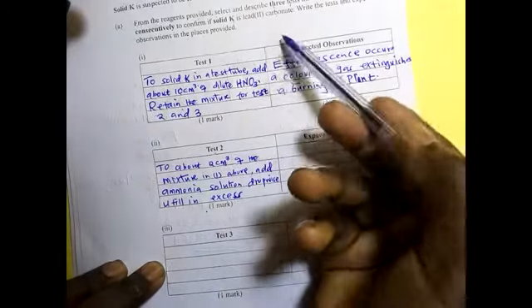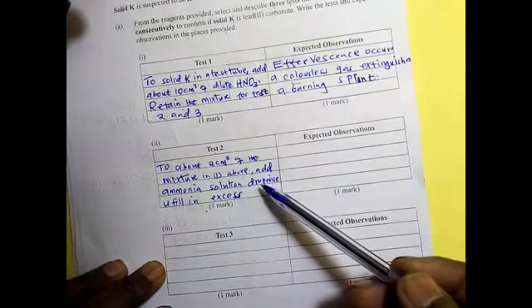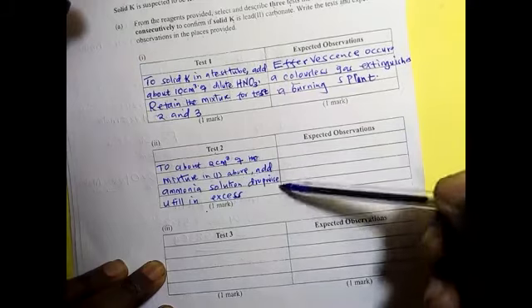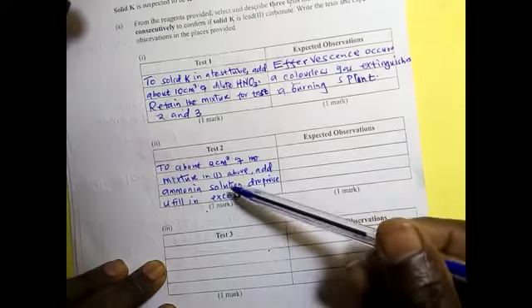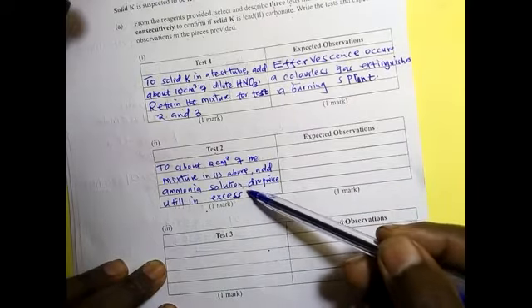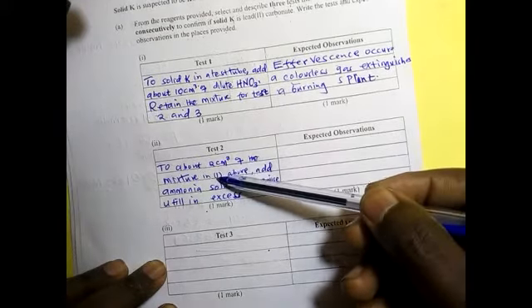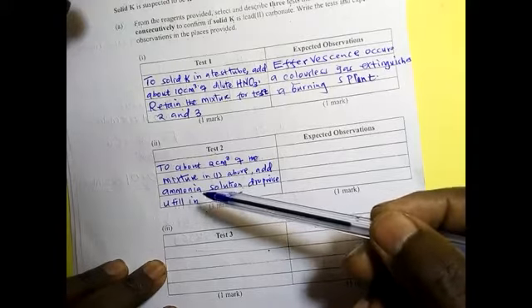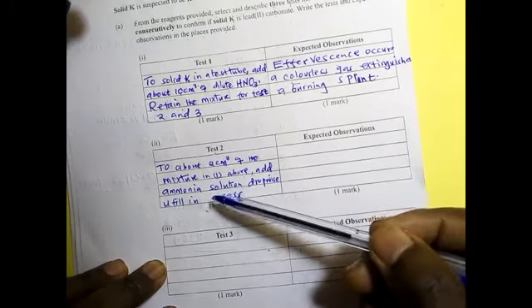Because we are expecting lead, what happens when ammonia is added? Suppose lead was in that solution, what will ammonia do? Ammonia will form a white precipitate, and that white precipitate will be insoluble in excess. Remember, when you add ammonia dropwise, a white precipitate is formed, and in excess the white precipitate dissolves to form a colorless solution that confirms zinc ions.